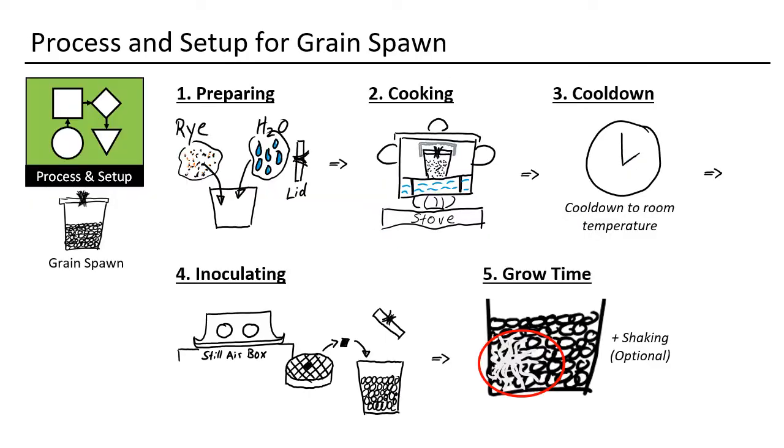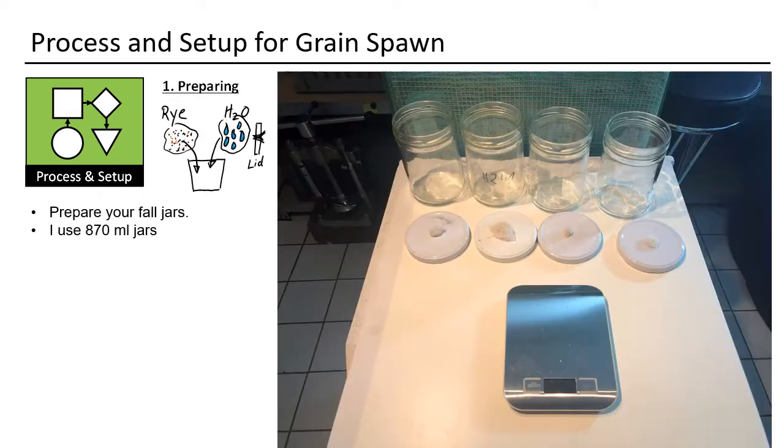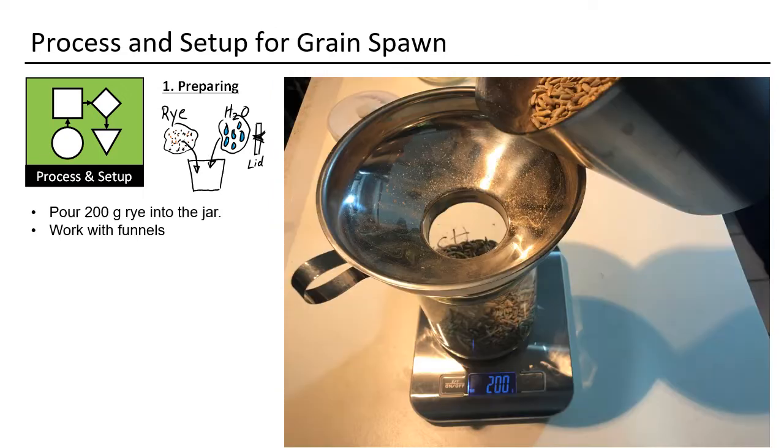The process contains five basic steps. First, you prepare the material. Second, you cook the jars. Third, you wait for a complete cool down. Fourth, you inoculate the jar with an agar culture. Fifth, you wait again. You start by preparing your jars — use a funnel to fill in the 200 grams of rye.